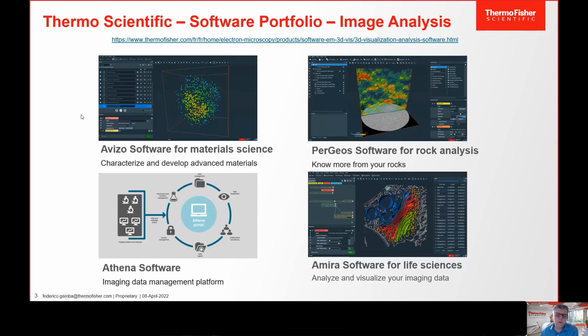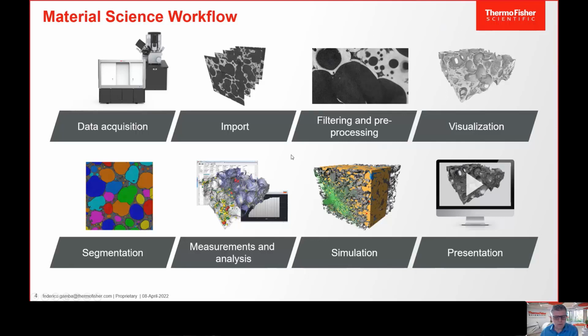And my idea was to go through some hands-on and through some real demo of the product. You will see the user interface. So you will appreciate the difference and the reason why we have two different software. Yeah, so I think that's enough for this.